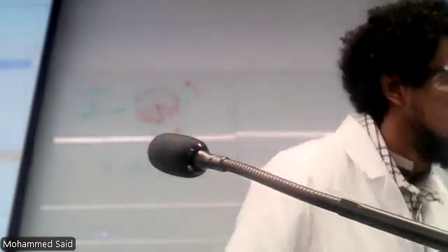How's everyone doing so far? Good? Kind reminder, it says 47 minutes, but we are in good timing to almost do the conjugation for the third plate for this final exercise. Before we end off, please bear in mind the following.